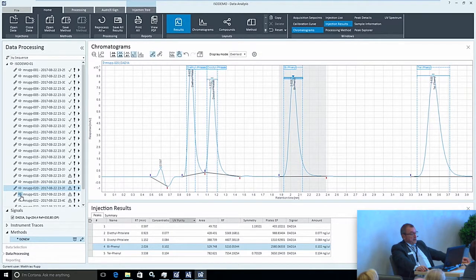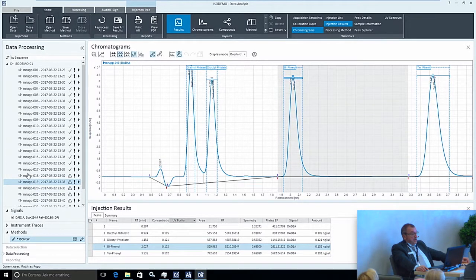You could easily see that this is quickly to be done, and you will also see by indicators here that a manual integration has taken place. If you think this is not allowed, we don't allow it in our system, this is simply because you may not trust that this is recorded by our audit trail, but it basically is.